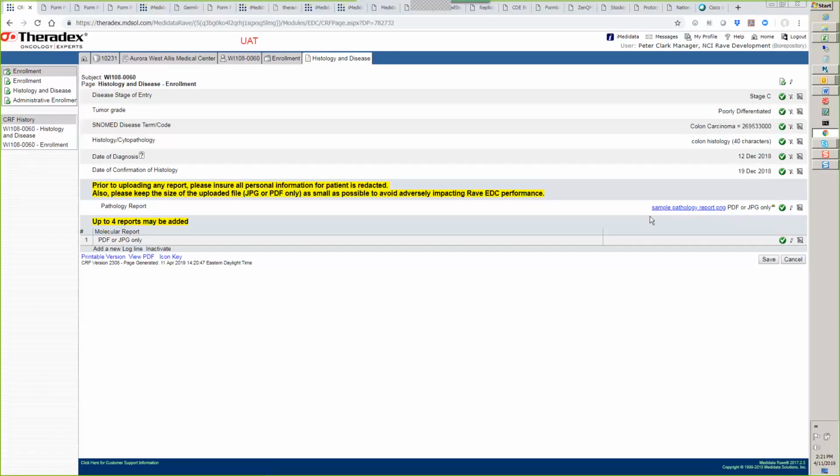However, if a specimen is being shipped to the biorepository and then on to, say, the MOCA lab, I'm not sure if the biorepository will comply with including hard copy reports. And it's really going to be dependent upon each protocol in terms of what might be needed.